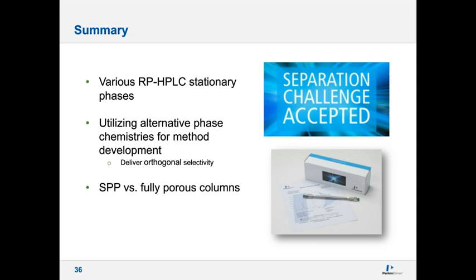Finally, SPP columns can also provide benefits over fully porous columns in method development, due to their increased efficiency and reduced runtimes, which also increases productivity and provides large savings in solvent consumption.